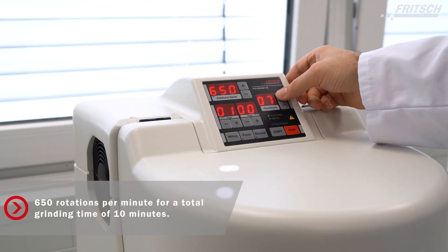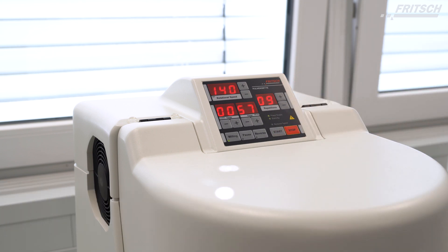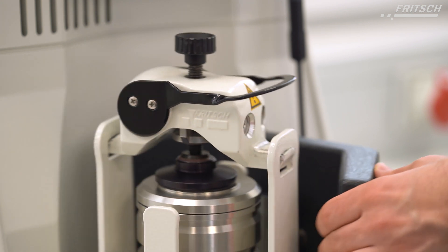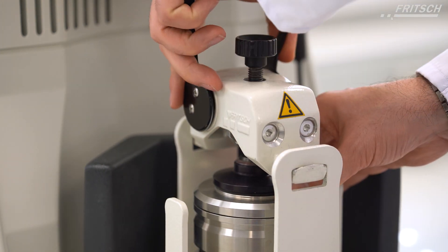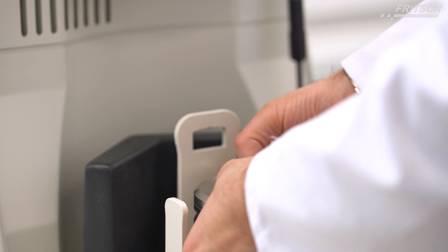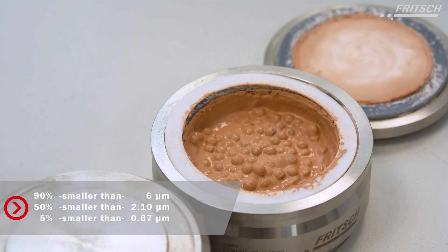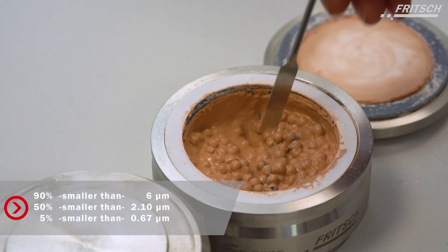For the last step, the instrument is now running with the same settings but with nine repetitions. This long grinding time in combination with the small grinding balls is required to get a finely ground sample. We now have a finely ground rock sample with 90 percent of the sample volume smaller than six microns, using the Fritsch Planetary Mill Pulverisette 6 Classic line.